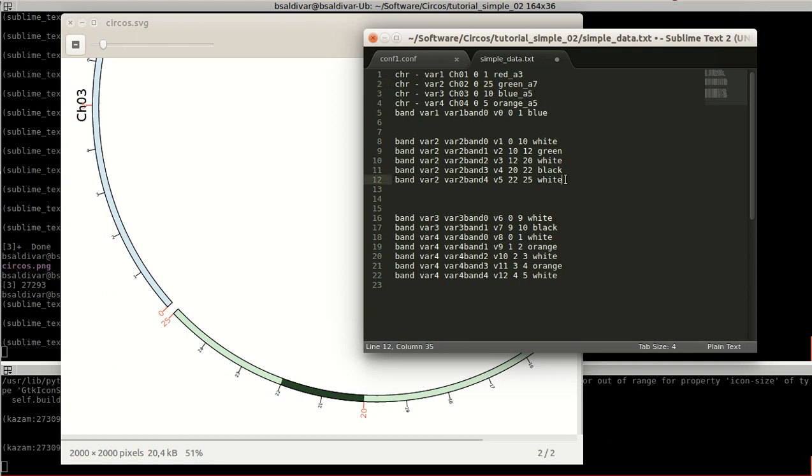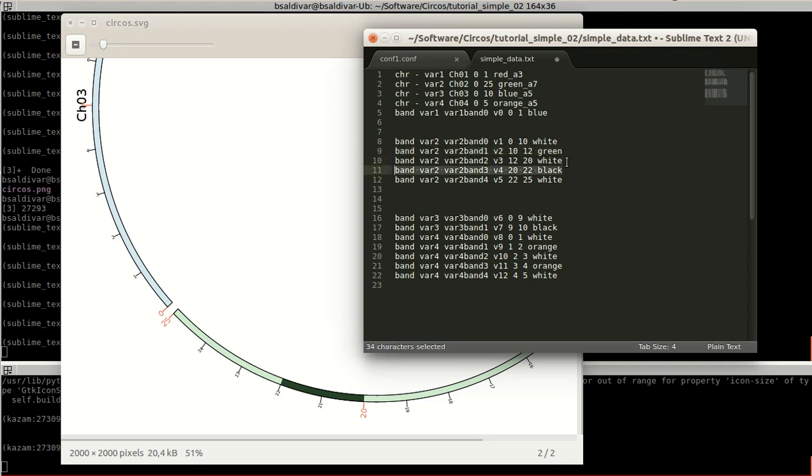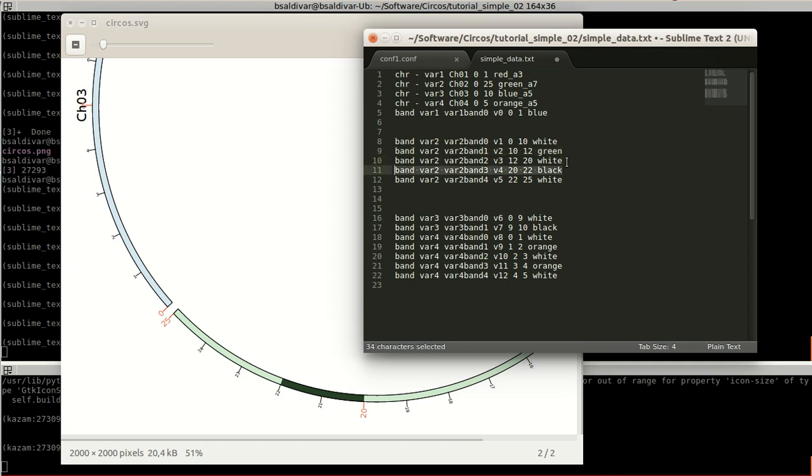As I'm interested only in showing two bands in all these karyotypes, I am specifying them here as green and the other as black. Everything that I don't care I'm setting to a color of white. So basically, my focus here is going to be on band 1 and band 3. That's why I have specified them with a color different from white.